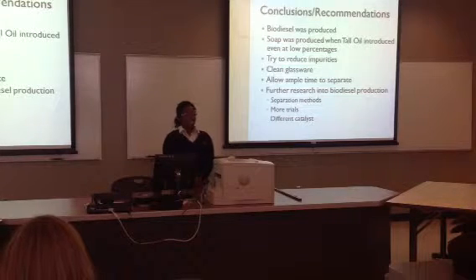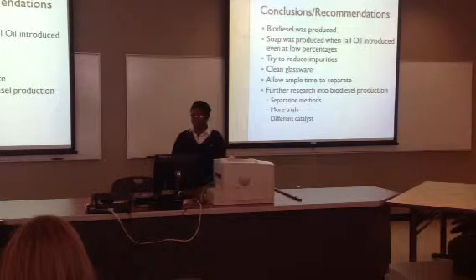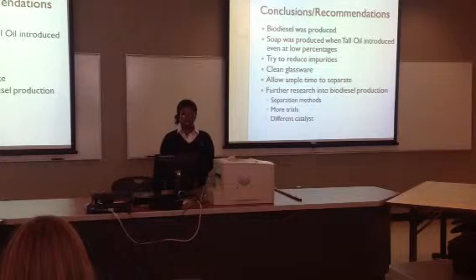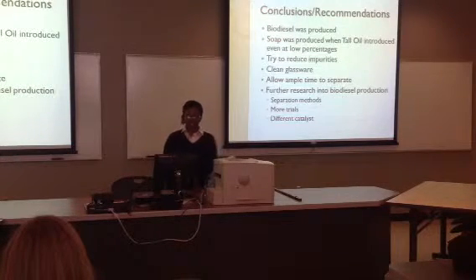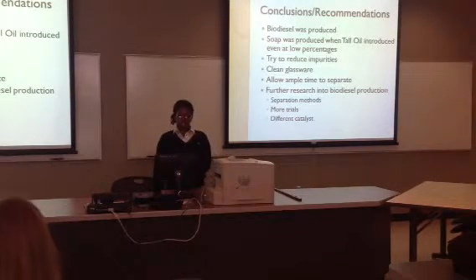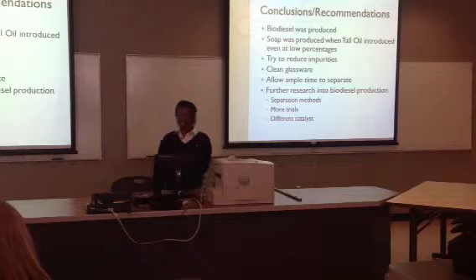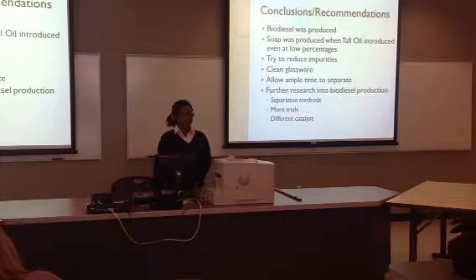And use clean glassware, because that's where error was introduced. When separating, we weren't cleaning all the time, but the second time we did. Allow ample time to separate layers. And further research into biodiesel production on a small scale could be done in this class. We could try different separation methods, more trials of course, and possibly use a different catalyst for this.